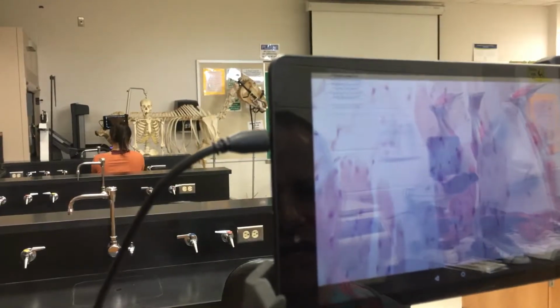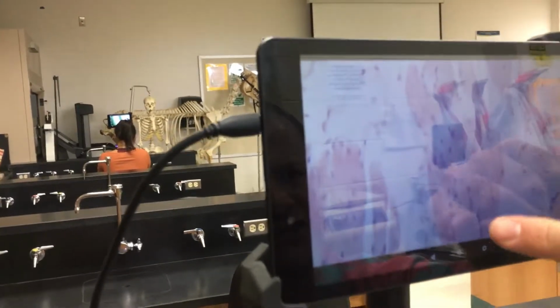But you can kind of see a little striations in here. See that little striation right there? Okay, so that definitely tells us that it's not smooth muscle. And they're big, long cells, and they have lots of these purple dots, which are the nuclei. So that's going to tell us it's a skeletal muscle. And what do I look for in cardiac muscle? Let's look for... Oh, is that cardiac in there too? Yeah, all three of them should be on here.